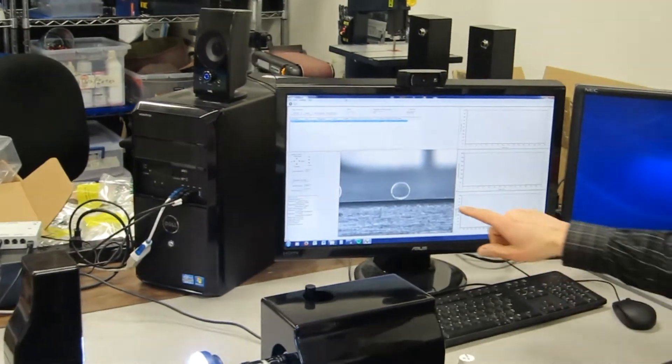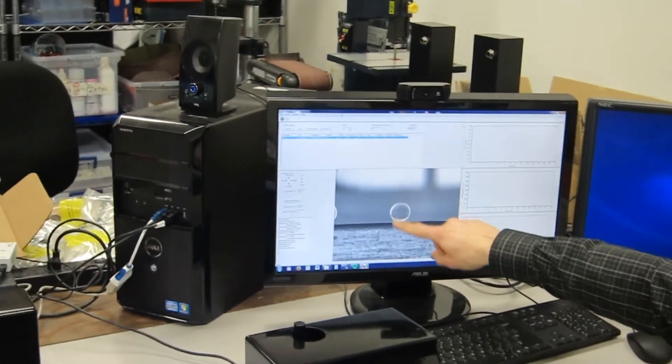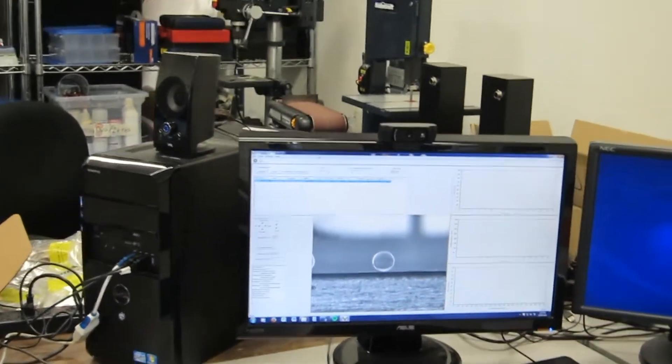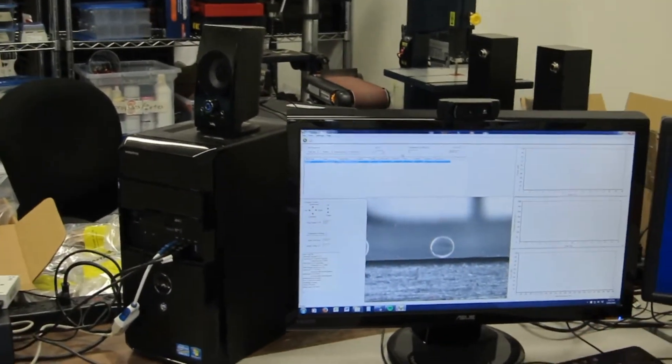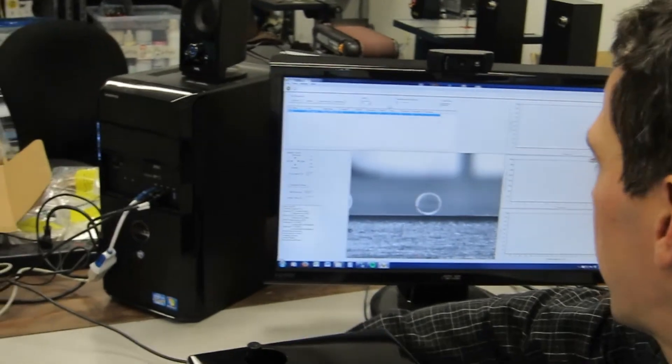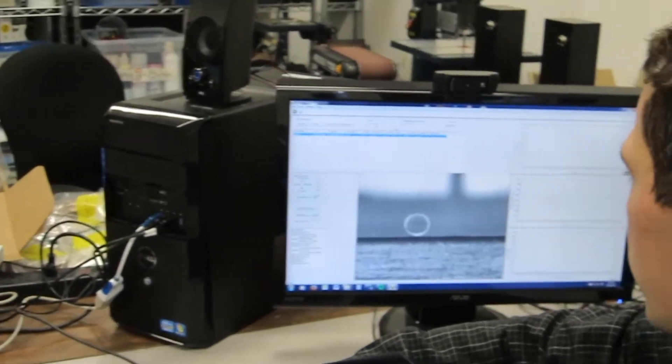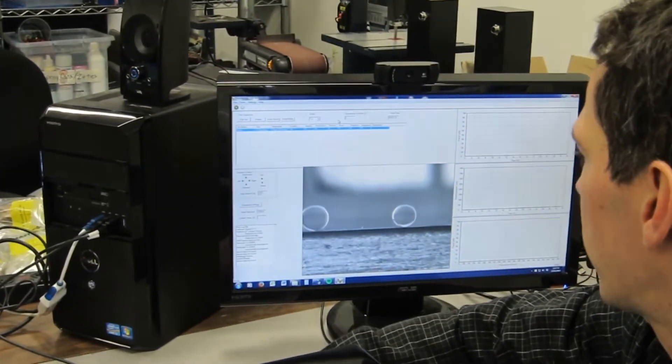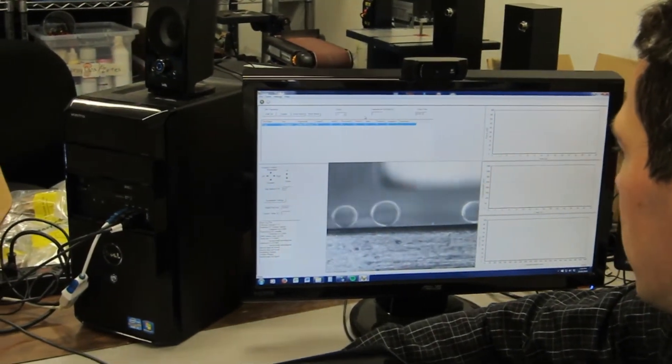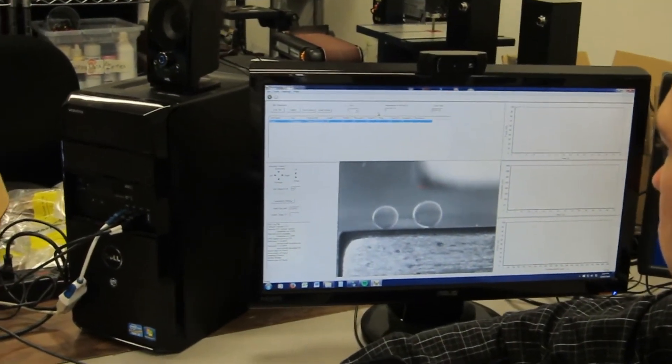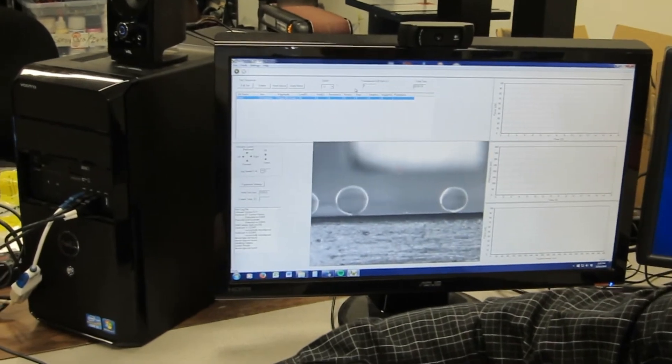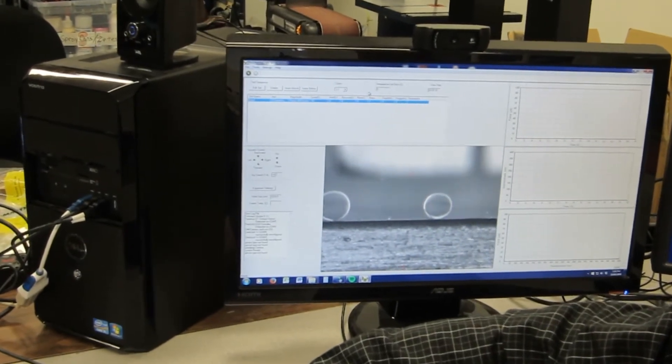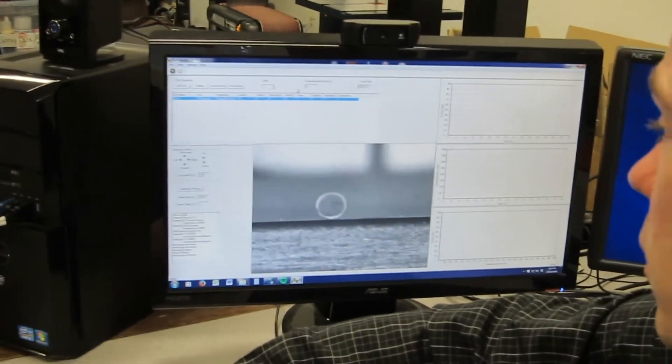So on the screen here, there's one here, just happened to fall right in the middle of the screen. But if I move the camera back and forth, I actually did drop in a few of them there and they're sitting on that lower fixed surface in the system.